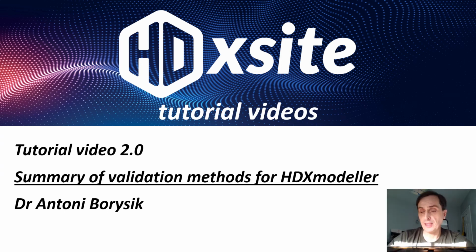Hello and welcome to video number 2 in this series of tutorial videos for HDXmodeller, and in this video we're going to go through a summary of the various different validation methods that are used by the algorithm.